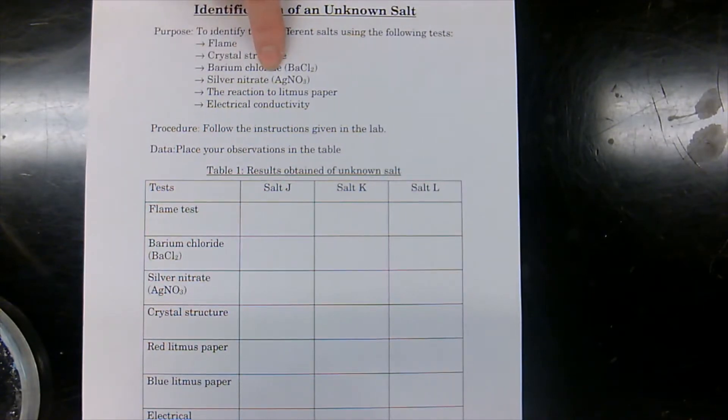And we're going to be doing a silver nitrate test. So the silver nitrate test, almost like the barium chloride test, this one is going to tell us if there is chlorine ions in our salt.